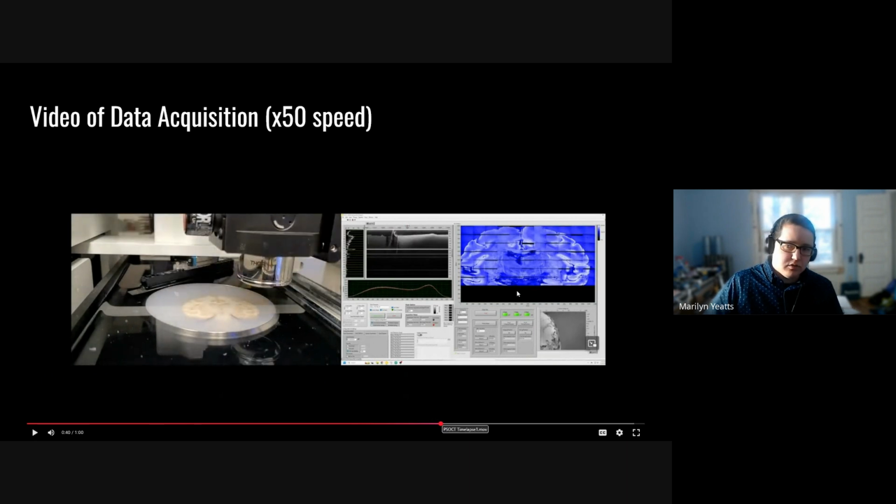if I skip ahead, please pause it. If you look here, you can see that right here on this image, it's a bit dark on the top of the thalamus. This is actually a cutting artifact. The reason that it's dark is because the surface isn't completely smooth and flat. And when we have issues like that, that can distort our data or give us errors in our calculations, depending on how bad that distortion is and depending on which contrast you're talking about.